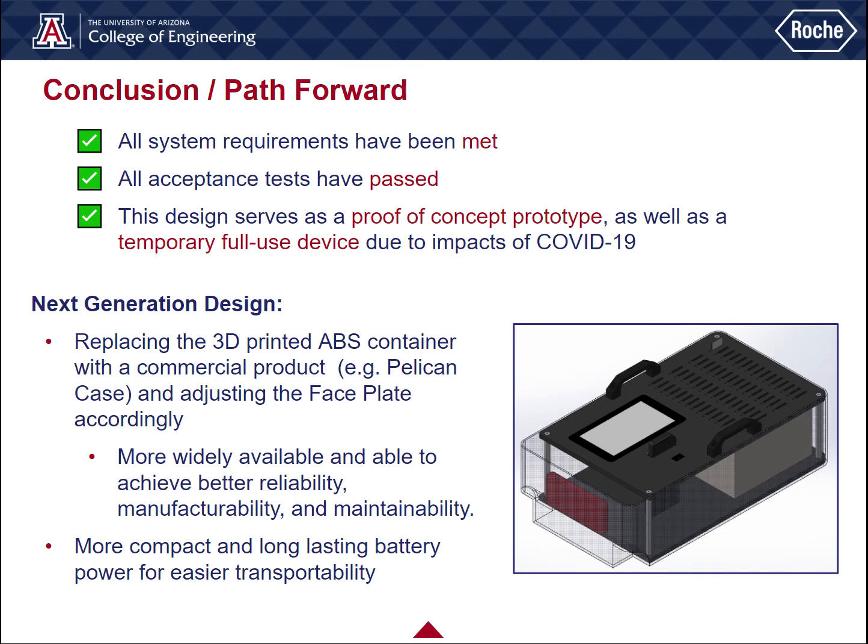In conclusion, all the system requirements have been met and all the acceptance tests have passed without any issues. The design serves as a proof of concept prototype as well as a temporary full use device due to the impacts of COVID-19. Our team was able to prevail even when the circumstances changed drastically.